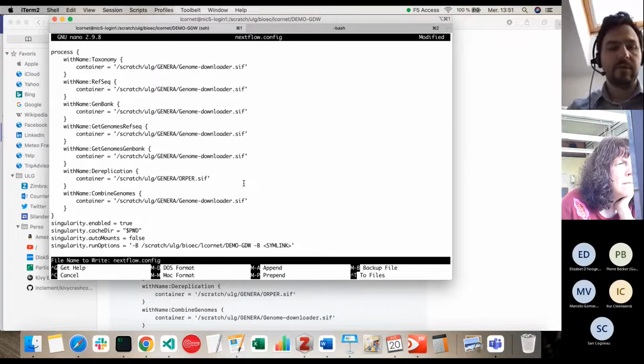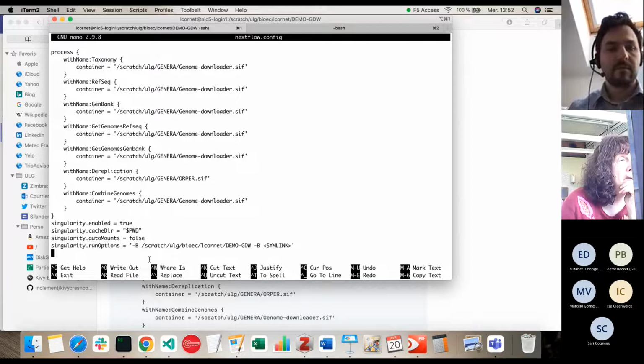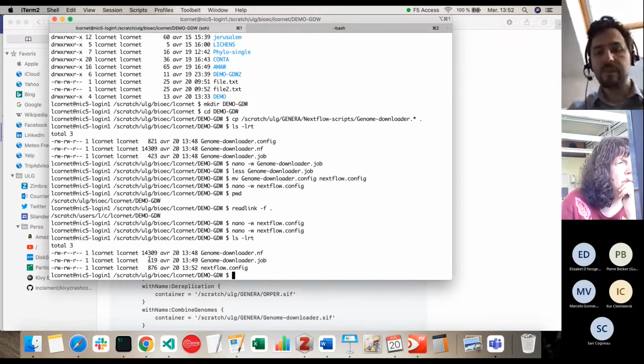You register, yes, and you take the second one. And again, you edit that. And that's it. The job is ready to be launched.